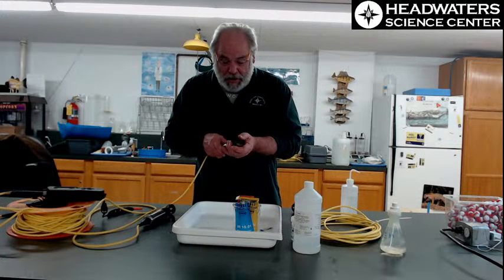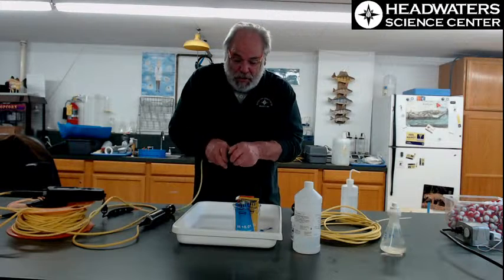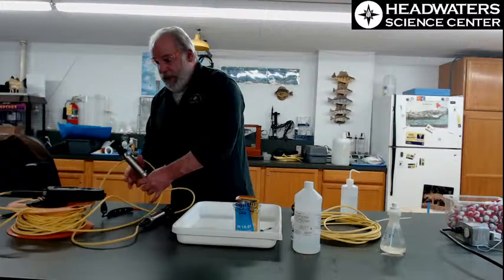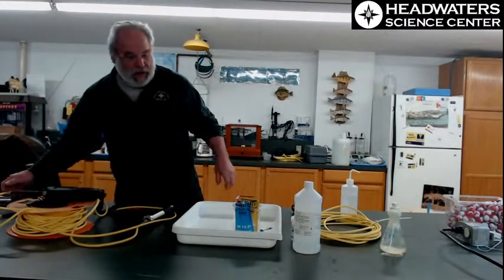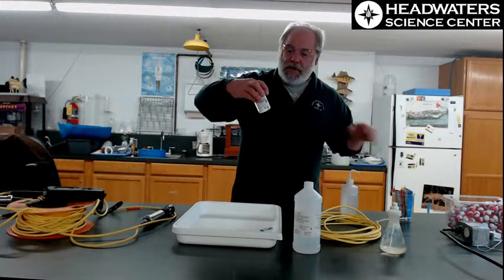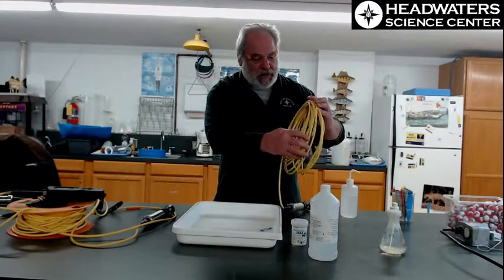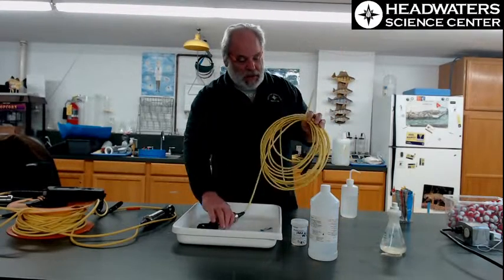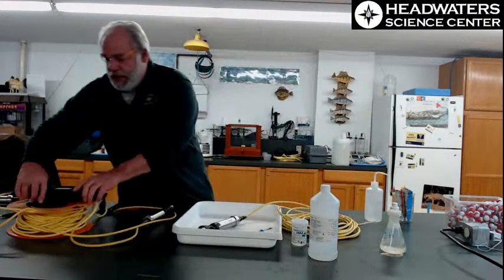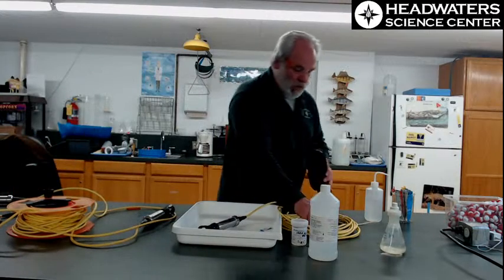pH is the one meter that actually does drift the most of all of these readings we do out here. pH probes tend to be the most unreliable, but we work with it because that's what the equipment limitations are. Now the other thing we're going to calibrate right now is the conductivity. That's this probe right here. Put that in there. Maybe I'll loosen that up a little bit, get the meter disconnected from pH. The meter's going, where's my probe? I'm going to put you right on there.